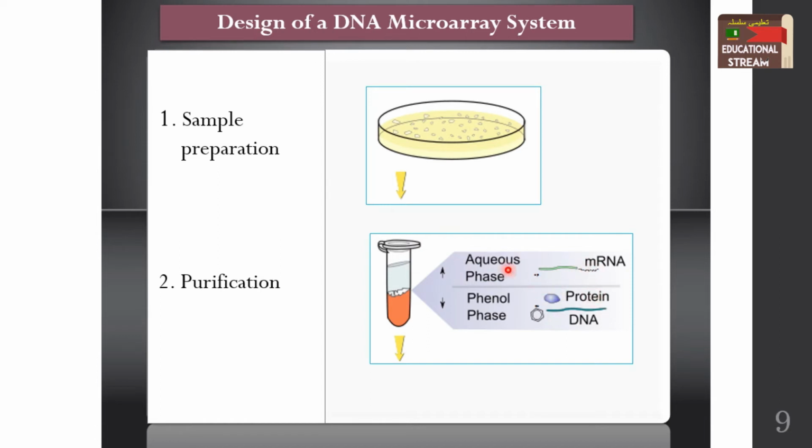We will carefully isolate the aqueous phase from this tube. As you can see in this tube, this is the aqueous phase and this is the phenolic phase. We will use the aqueous phase and discard the phenolic phase.